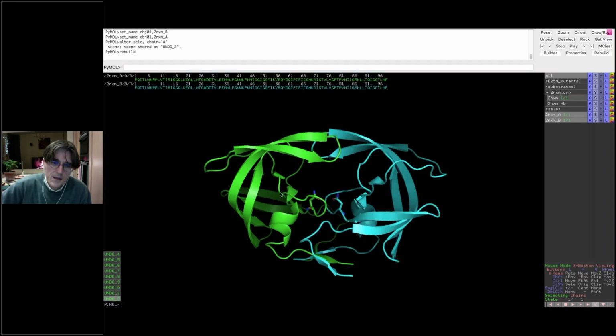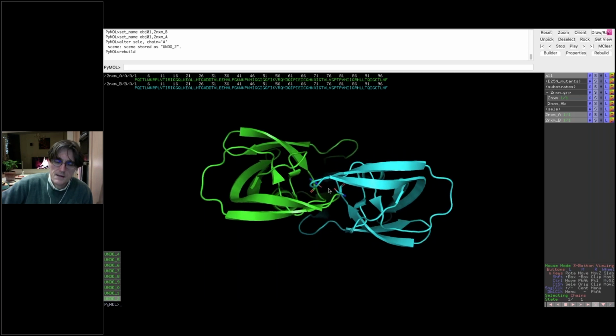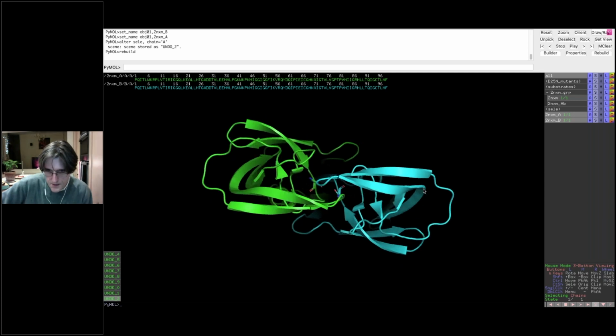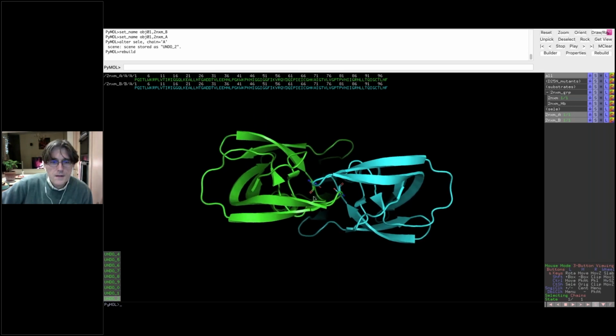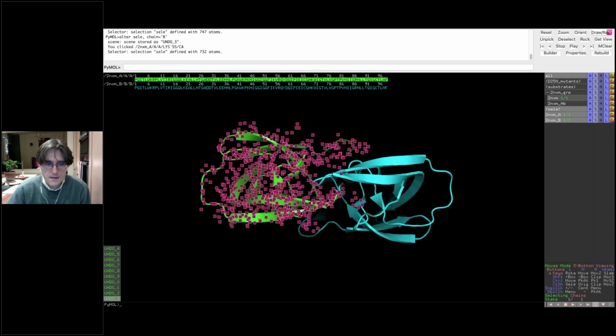There are some HIV protease structures where you've just got one chain in the asymmetric unit, and the symmetry is such that when you look down the C2 axis, it would generate the second chain. If you were to do that, you would end up with 2 chain A's. If I were to now try and merge these together, it would create all kinds of problems. So what you'd have to do is make sure that you change the chain ID to something different. B is reasonable. That's what it was.